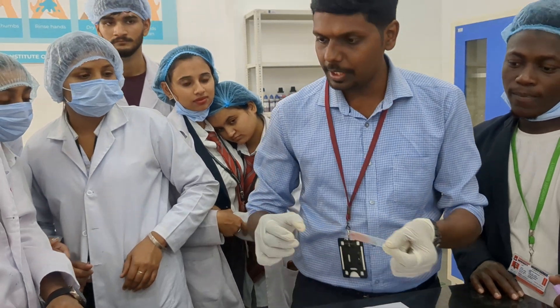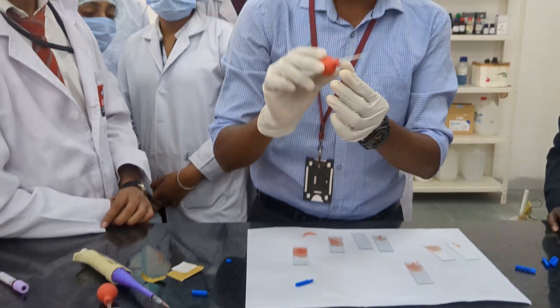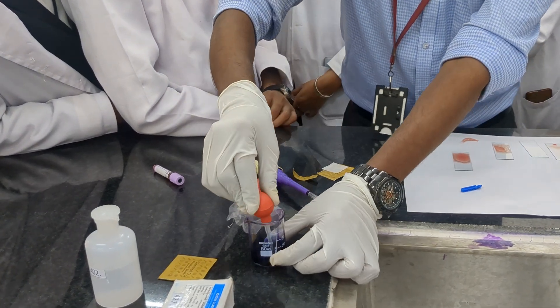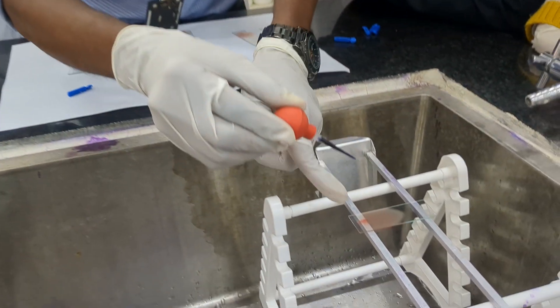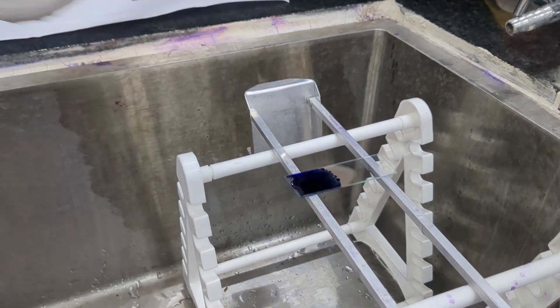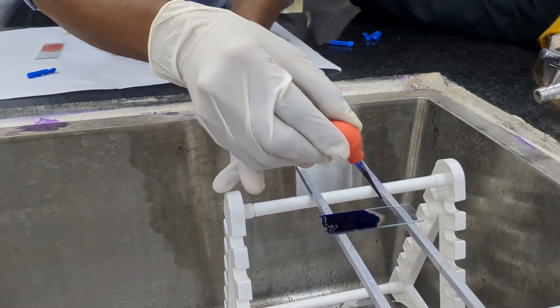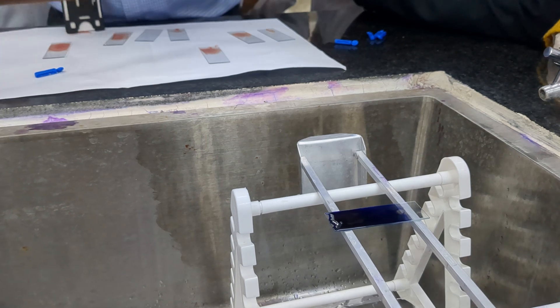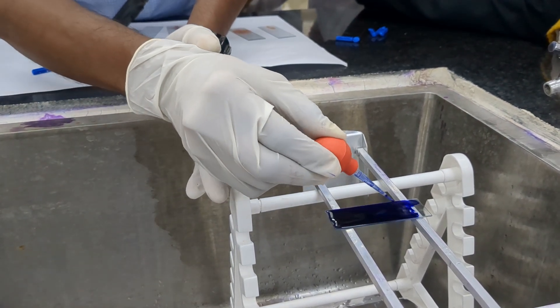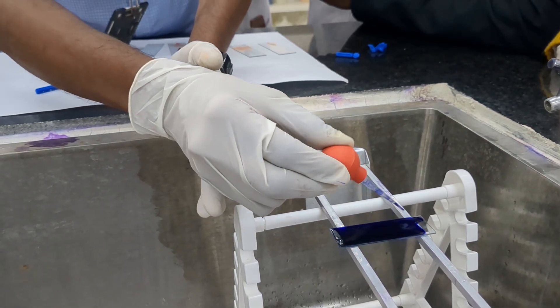The smear has been dried. We have to keep the smear on a staining rack. With the help of a pipette — we are using a modified Pasteur pipette, with a tip attached to a bulb — take Leishman stain and add it from the head portion of the slide, evenly covering the whole slide until it is completely submerged. You can blow air to mix the stain evenly. Wait for two minutes.